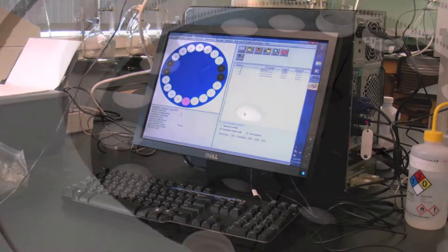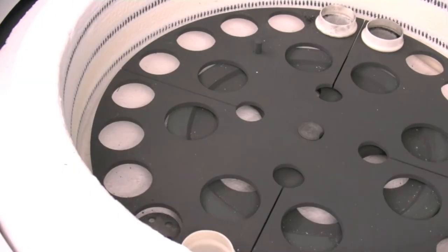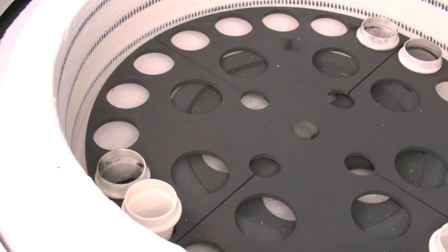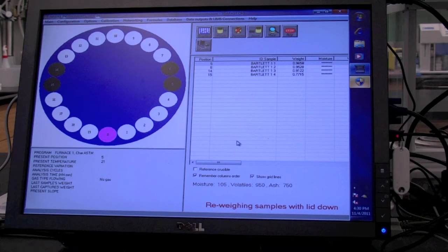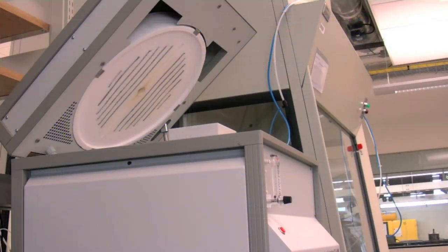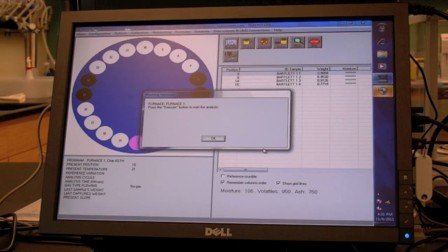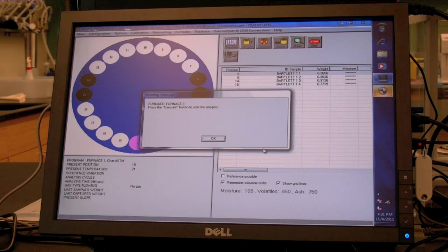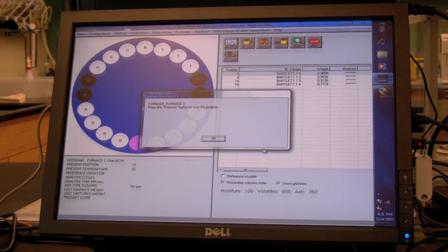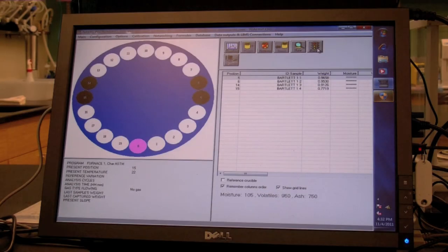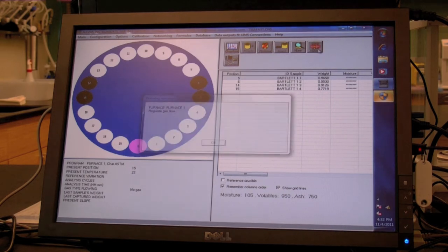Repeat these steps until all samples are identified and loaded. The instrument will automatically close the lid and reweigh the samples. After all samples are in the crucibles, press enter to continue. The instrument will automatically close the lid and reweigh the samples.